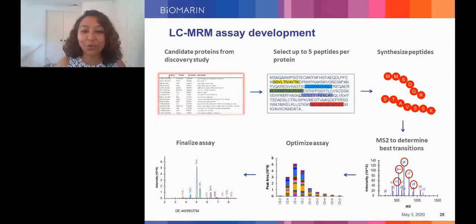So now you know when you add these and spike them into your sample, what signal in your MRM corresponds to what amount. And then you can use these to elucidate the amounts of the unknown peptides. By unknown, I mean the unknown amounts of peptides, not the unknown identities, of course, because you have a targeted assay, you know the identities.